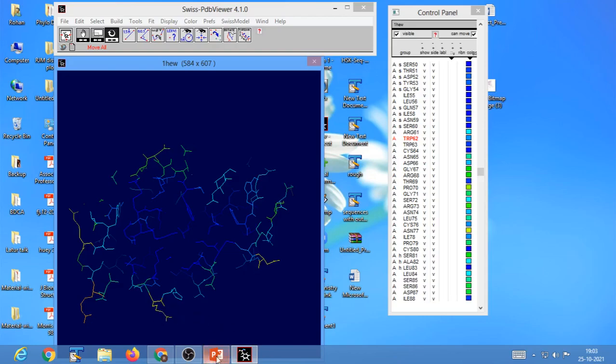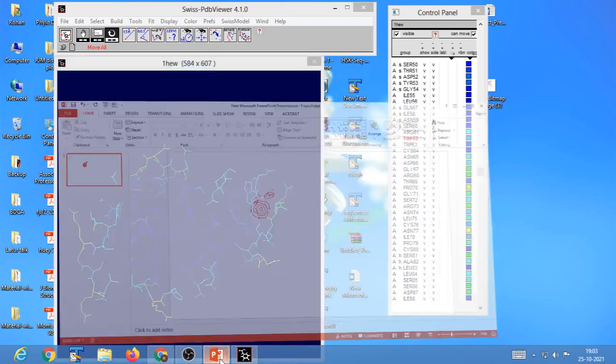If you are still not getting what this means, say this is your protein molecule, and when you took the slab, this is the center of your molecule. If you cut your molecule from the center and rotate it, you would get a transverse section.